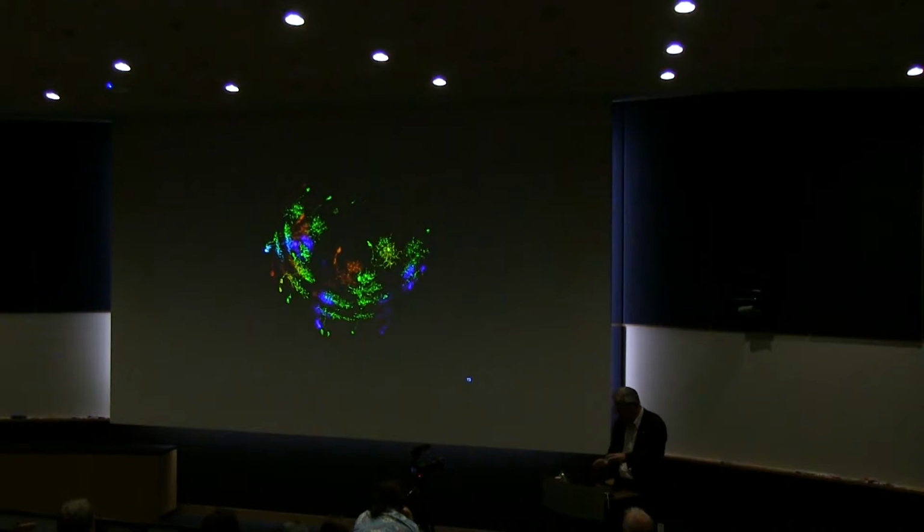So what we did is we took the promoter construct that would light up this particular thing, and then we added a cassette to decide whether or not it would turn on at very low probability. So we would turn on a neuron in that subset, which is already a subset of the 20,000, and we would get individual neurons. As long as you get neurons spaced sparsely, like this one from the optic lobe, you can trace the entire neuron. For example, here we can definitely get a model of the purple one, these orange ones, and this yellow one. They're quite distinct spatially.